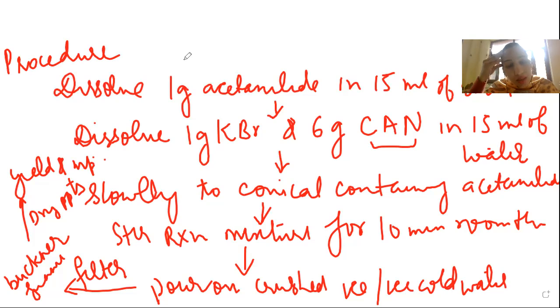But when we use the ceric ammonium nitrate and KBr combination, we will be using an aqueous solution, water, a green solvent. Moreover, the reaction in this case is fast, and it will also yield the para product in high yields. So these are the benefits of carrying out the reaction using the green chemistry approach.